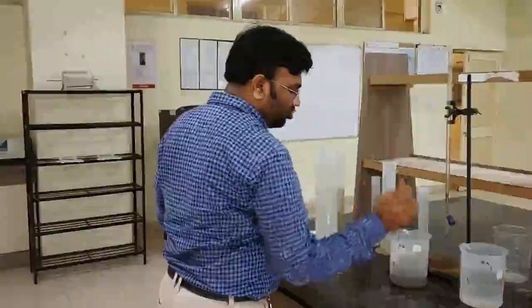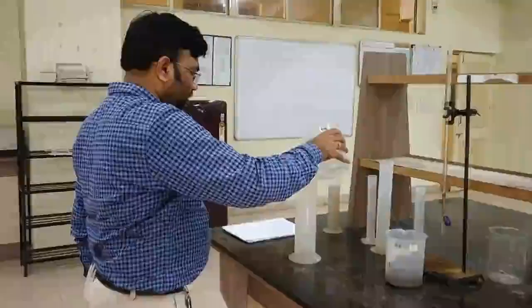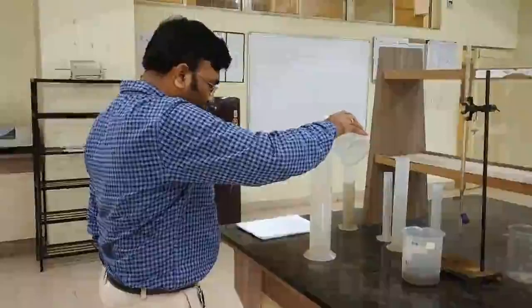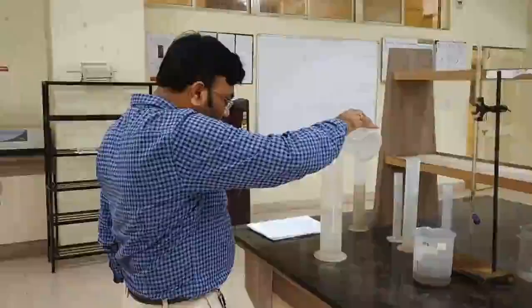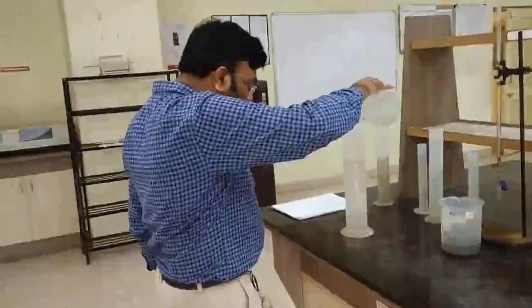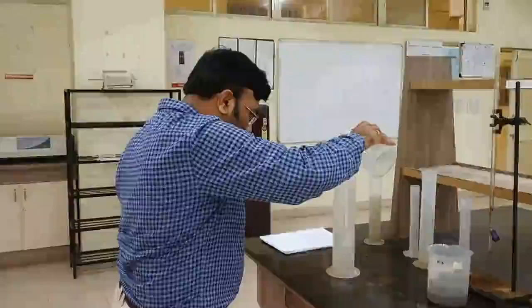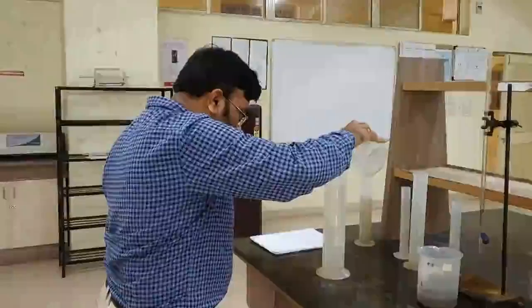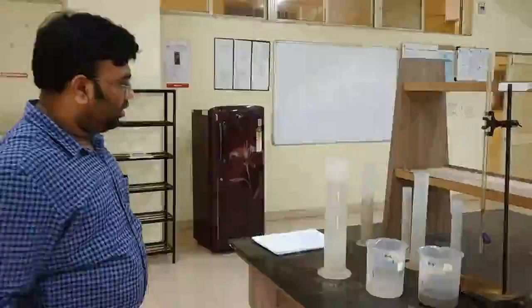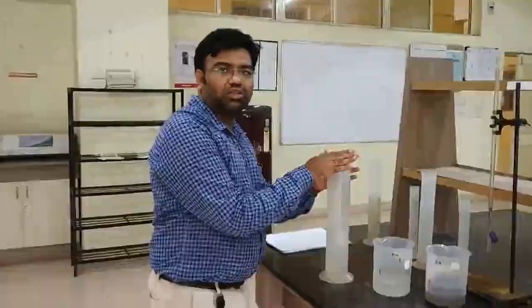Now the next step is to add distilled water so that the total volume becomes 1000 ml. Now we have made it 1000 ml.